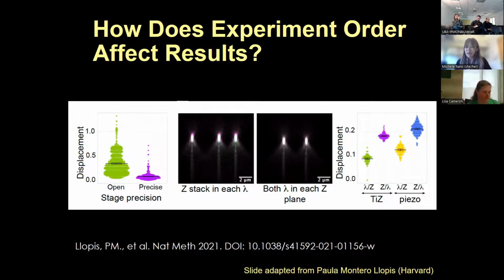And so if you think about when somebody else in your lab is going to use the microscope for something very similar, many of the things you tell them to do are not reported in the methods of your final paper or in a full protocol, but can have a very deep effect on whether or not you're able to use that data to answer the biological question that brought you to the microscope.